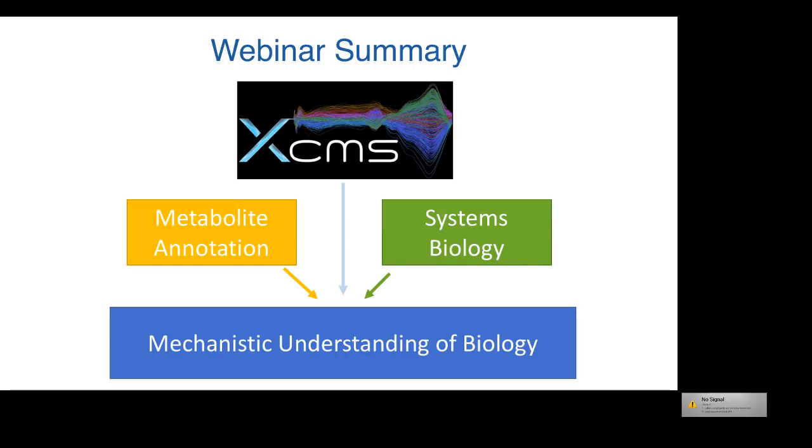And one last question is, have you used other software for integrating multi-omics data, and what were they?